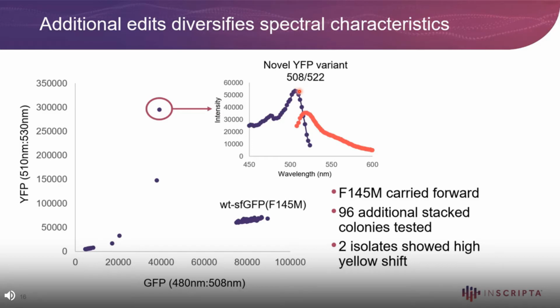previously been characterized. So this is just an example of using GFP as sort of a model protein. Obviously, you can substitute your favorite protein or any enzyme in its place, but just to show you an example that you can do iterative rounds of genome engineering within the Onyx platform in order to identify improved variants.